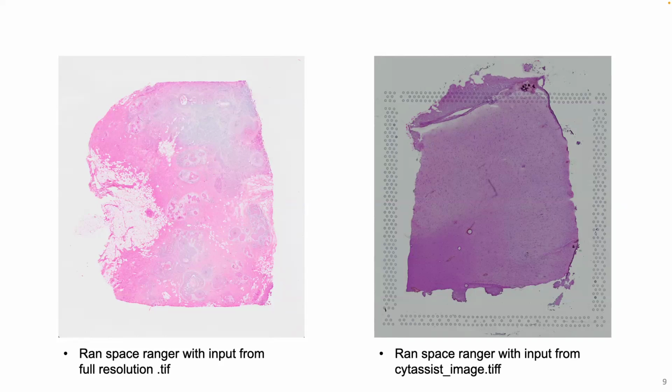So usually what I notice is that if the data is from 10x, then they would do it properly by downsizing the full res. But if it's from, for example, some experiment people set up, they would, by mistake, go to the CytAssist image, and then when you plot, you would have a misalignment. So yeah, here I want to say if you are generating the data, try to bear in mind that we do have to follow the 10x guideline that you run downsizing to high res and low res from the full res image.